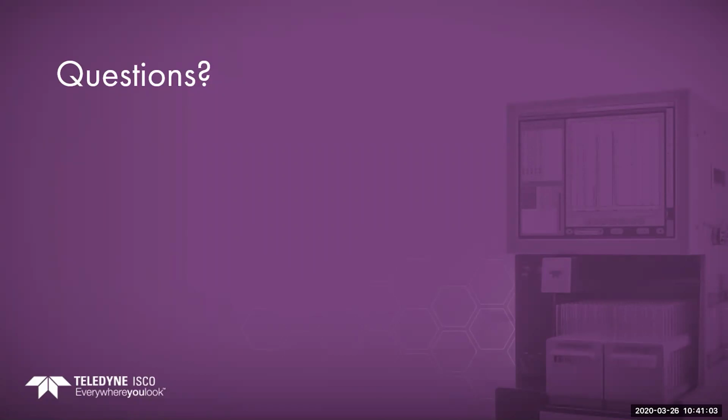Okay, I have another question. Is there an optimal range for focus gradient, such as 5% or less? I like to use 5% because it's very, very nearly isocratic, but allows me some error, like some of the peptides are affected by pH, so they might come out a little earlier or a little bit later. So I like to use 5%. A lot of people use 20%, but the focus gradient generator and that time on target algorithm has been generally giving very good results at 5%.